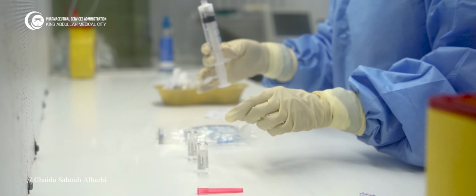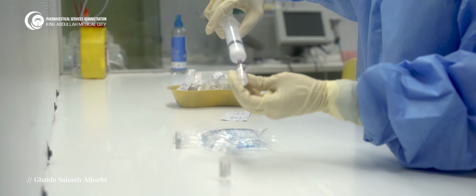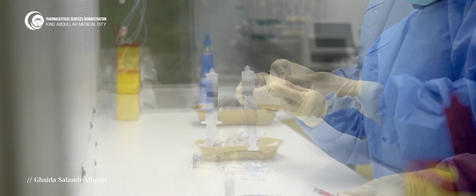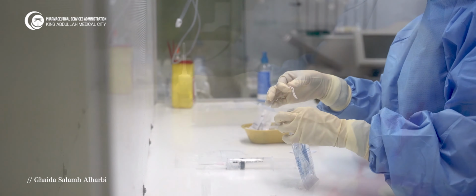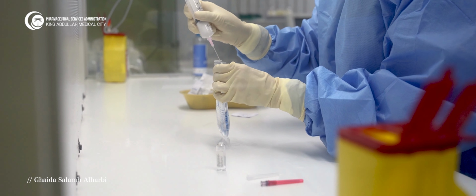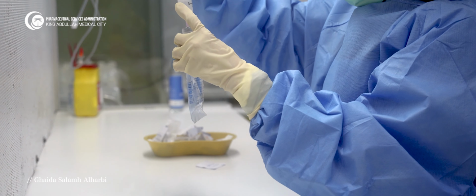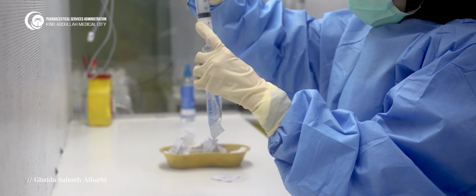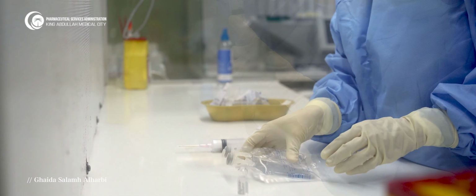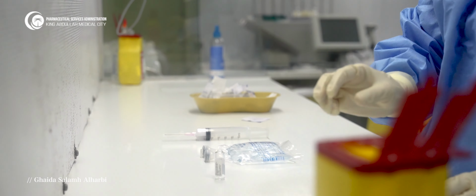Then after withdrawing the medication with the filter needle, in a way also not blocking the air coming from the HEPA filter, I will change the filter needle with a regular needle and transfer it to the final container. Make sure that the final container critical part, the additive port, is already wiped with alcohol also. For the sharp item, it should be discarded in a sharp container.